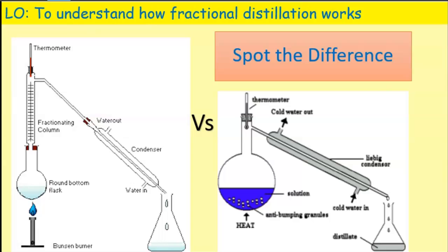Hello and welcome to a tutorial about fractional distillation this time. So very similar to the principle we looked at with simple distillation. However, there's just one slight difference with the equipment. So this time, if we look at the two pieces of equipment, this one was our simple distillation and the one on the left is our fractional distillation where we have a fractionating column this time. Okay, we'll have a look at what the use of that is and why we use it.